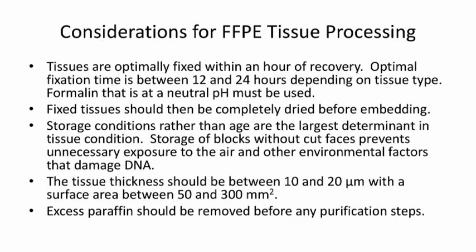So these are some of the things. We have, I guess, a more formal description of some of this that we do provide to pathology labs and surgical centers, et cetera, to try to help with some of this. These types of changes have actually been pretty well received by some of the larger pathology groups that we've worked with. So that's been good. Fixed tissues really have to be completely dry before embedding. That makes another big difference in the longevity of that material.